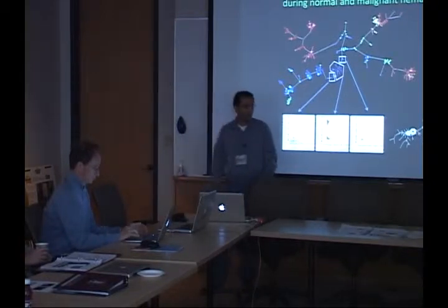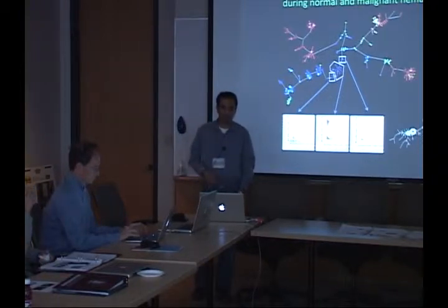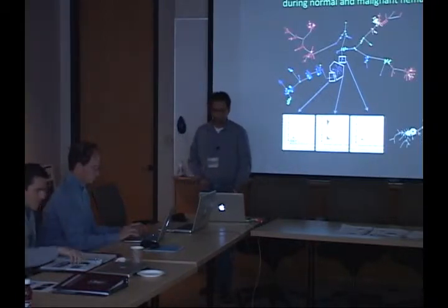And what I'm interested in long-term is how do these things respond to the therapies that we try and treat them with. But one of the things I developed to get at that question was a method for doing cell cycle analysis by the CyTOF, and that's what I'm going to talk to you about today.